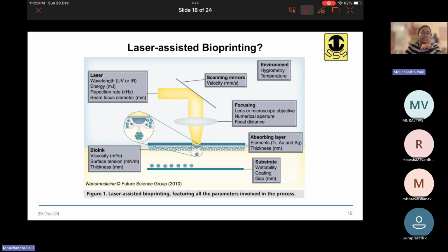It's also possible that your vapor bubble is too big, all right? And we defined a parameter that's called gamma in our lecture. That gamma value should be within the two threshold values that determine what regime of droplet formation we are in.